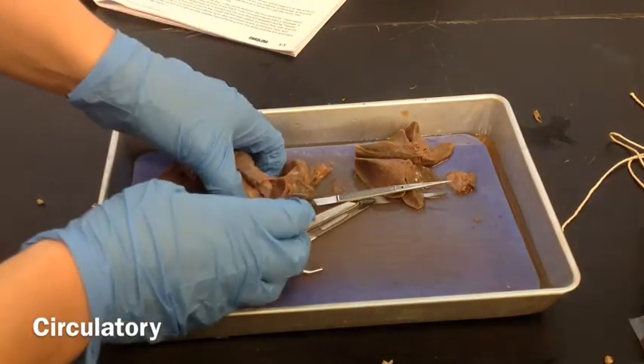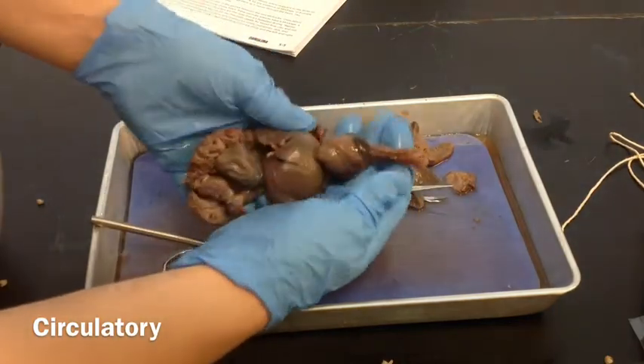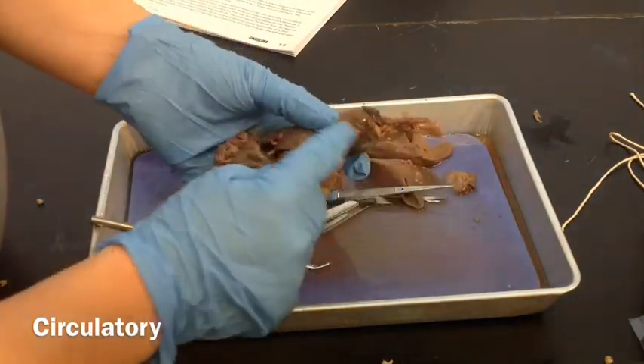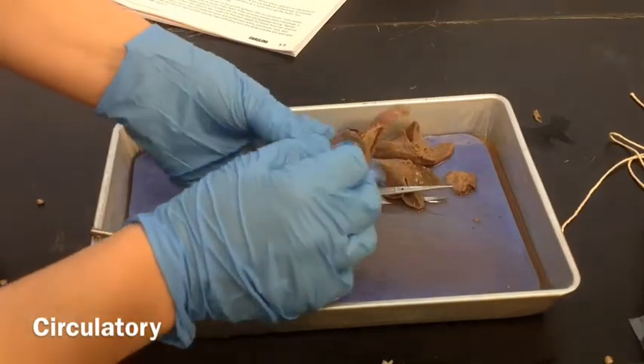We're going to go ahead and do part D, which is the circulatory system. Looking at your organ block, you can see the heart is the last part left in the thoracic cavity — that's the upper body cavity.